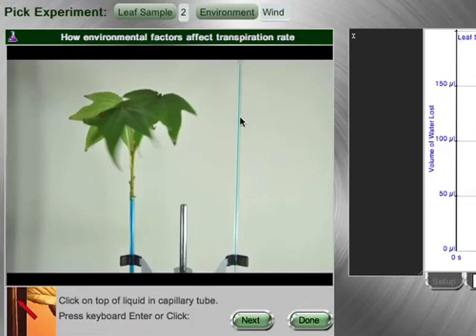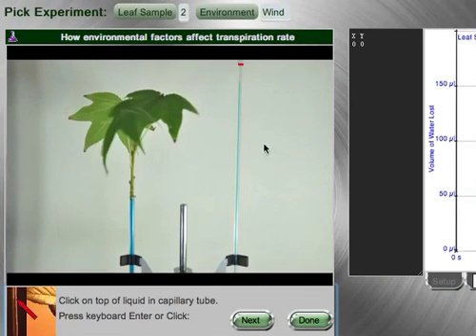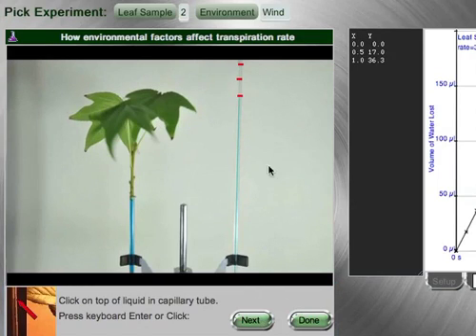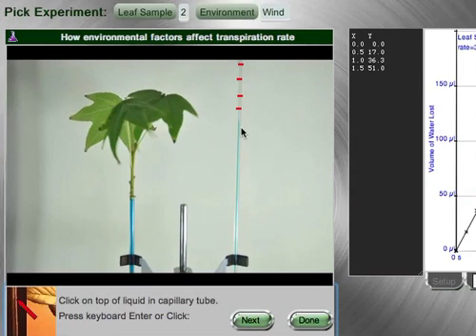In this lab you will track the level of water in a capillary tube that's connected to the plants by clicking on the height of the water. As the water goes down, you know water has evaporated out of the leaves, and therefore the leaves are taking in more water from the capillary.